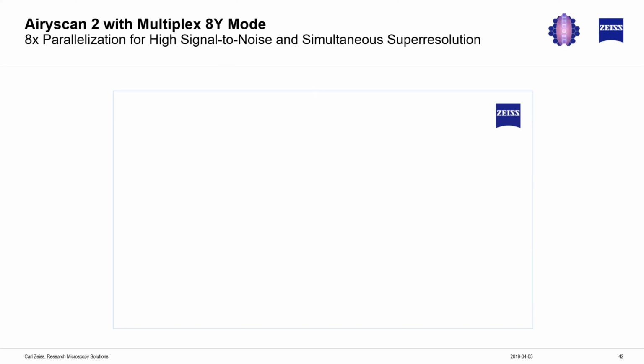And so that mode, basically, whether we're doing super resolution sampling or whether we're doing confocal sampling, we can end up getting about an 8-fold improvement in speed as a result of that. So this method especially is very good for imaging fast samples and imaging quickly through large volumes. The Airyscan super resolution is very good for really pushing resolution and sensitivity on the system to the limit.